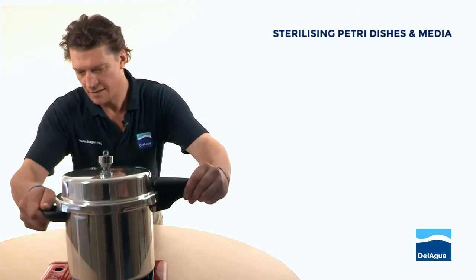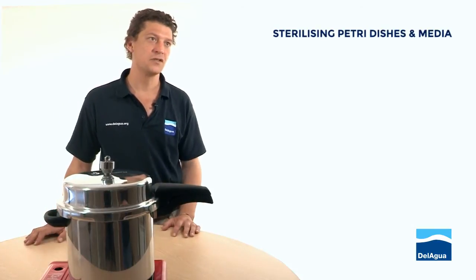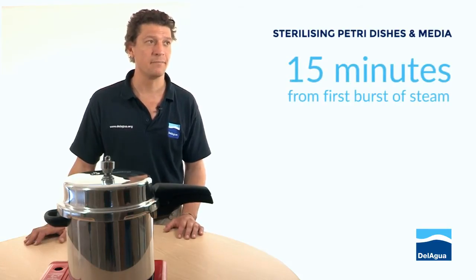I'll then place the pressure cooker onto the heat source. I'm going to allow it to come up to temperature for about five minutes or so until it gives its first burst of steam, and then I'm going to keep it on full power for another 15 minutes.